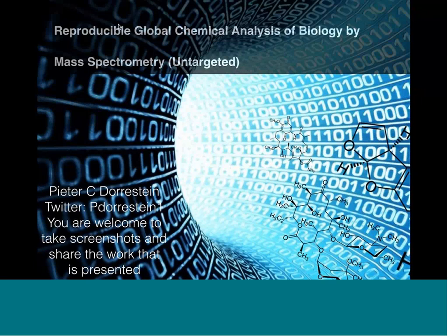So let's say you have a spectrum that is found in American Gut, and then a spectrum that is found in that particular bacterial data set. You can at least say that that molecule that was detected is found in that particular bacterium as well. And so you can do that with all sorts of bacteria.